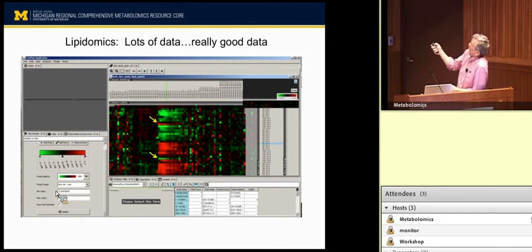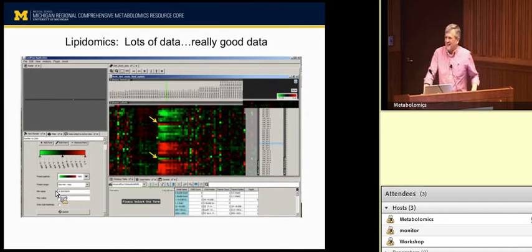Look at this green: it's all red there, and all green here and red there. My guess is that we switched the sample. So you can use this to vet your data and understand there may be things going on from a technical standpoint. Then the question is, what do you do with that sample? You just throw it out? You probably have to.